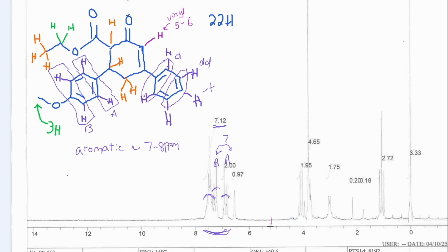We don't have anything between 5 and 6, but we do have a signal over here that integrates for about 1. So we have 1H here, and it is a singlet. This proton over here does not have any neighbors. The next carbon over has a double bond to oxygen, no protons there. This carbon here has 4 bonds showing there's no protons there, so there are no immediate neighbors. So having it be a singlet makes sense. So we have that proton over there.